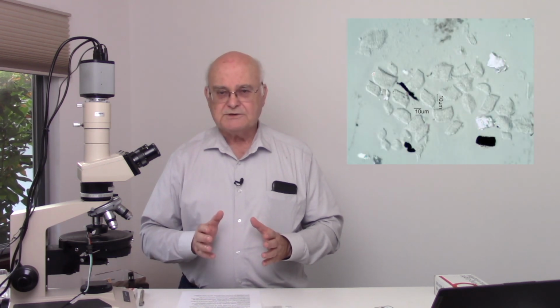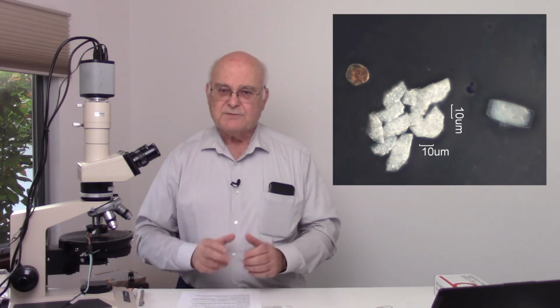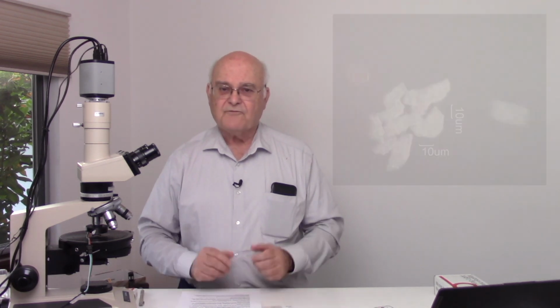These calcium oxalate phytoliths go through a number of transitions chemically that change their optical appearance, but the shape stays constant. The shape of a calcium oxalate phytolith fresh out of a tree, a leaf or a bark, has a characteristic shape for that type of tree and that particular part of the tree.